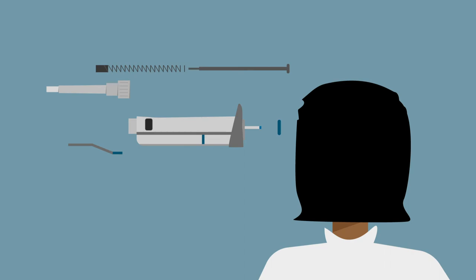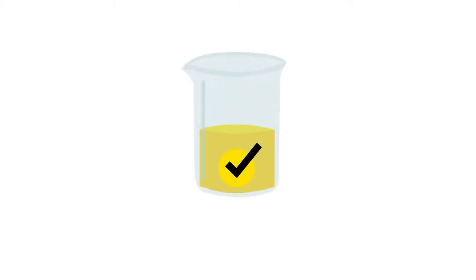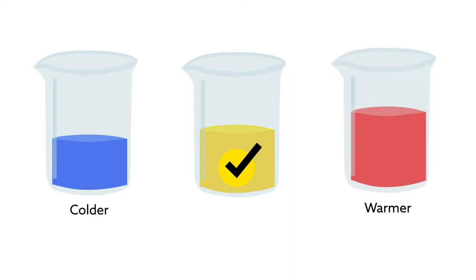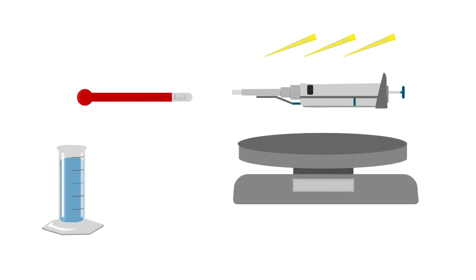To calibrate your pipette, use samples at the same temperature as the liquids you will dispense later. Colder liquids are denser than warmer liquids. You'll need a pipette, tips, roughly 5 milliliters of distilled water, a thermometer, a balance capable of measuring micrograms, weight boats, and a container for the water.